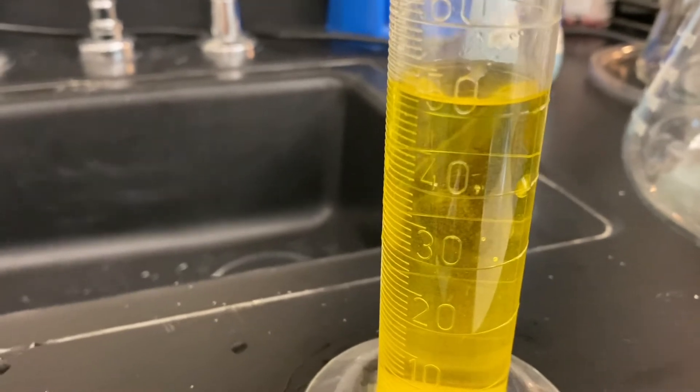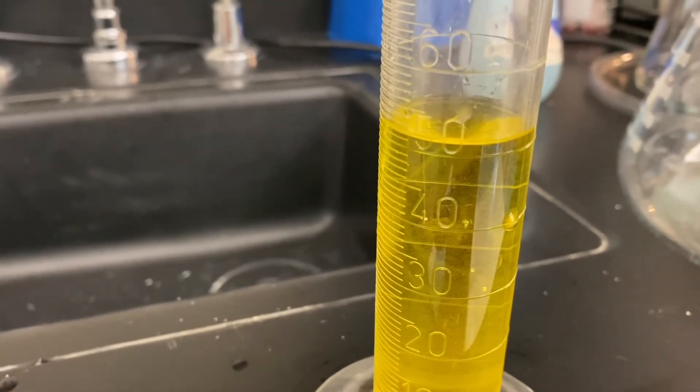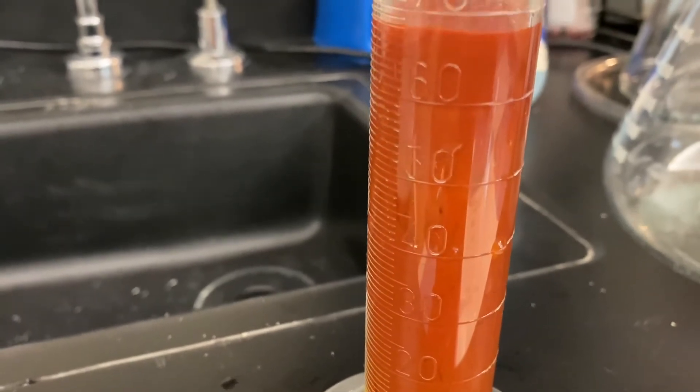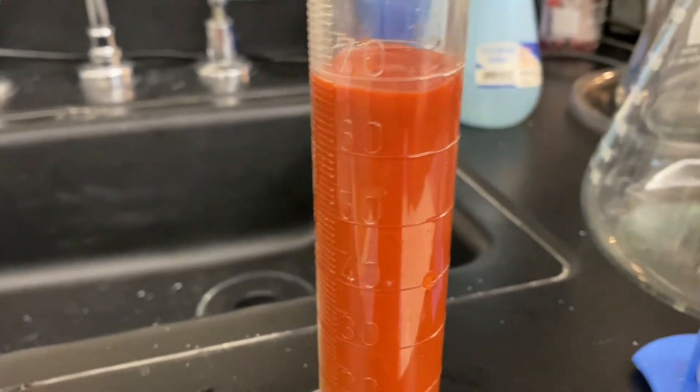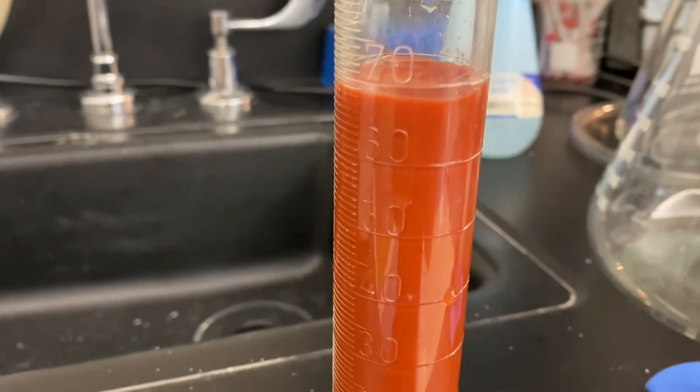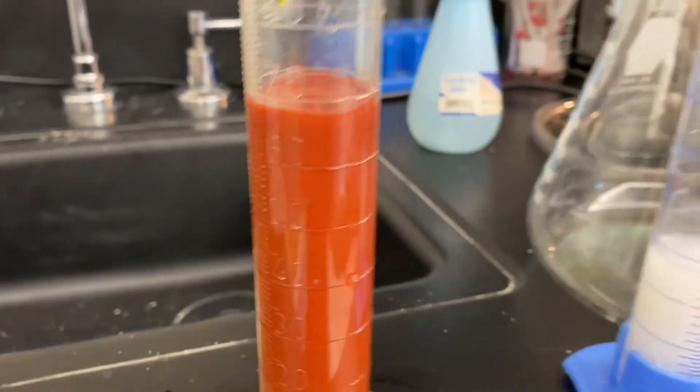check out how the solution changes as a precipitant appears. It's so exciting. That solid red silver chromate appears immediately when you add the two solutions.